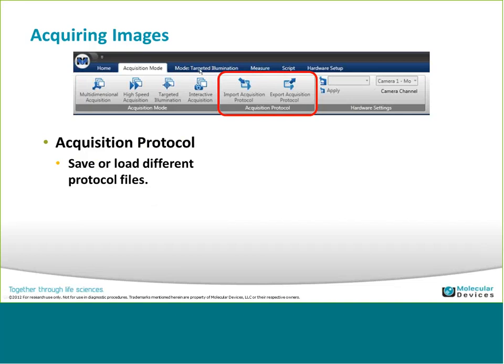The one thing that you can't do, which is a follow-up question from, I believe, last week, is dual camera acquisition. If you have two of the same cameras installed on the system, can you do a side-by-side, where you select both cameras into a single image acquisition window? You don't have that ability. In Metamorph 7, the channel selection is where you would select that: camera 1, camera 2, and both cameras. Well, in Metamorph NX, you don't have that ability to do dual camera acquisitions.